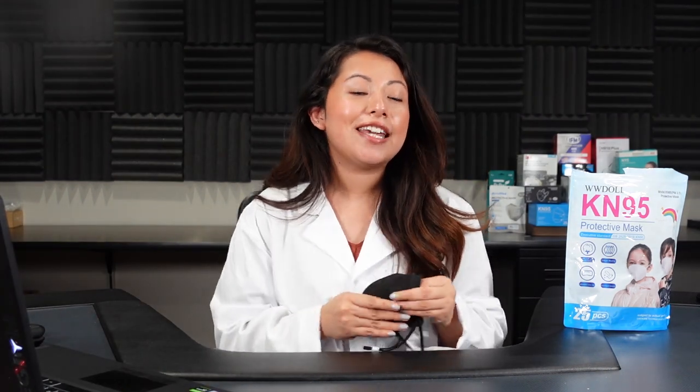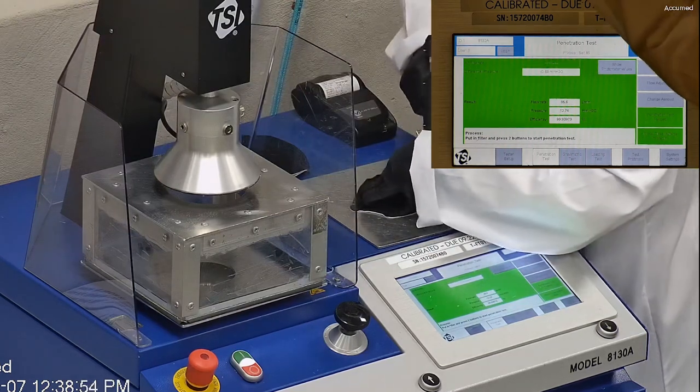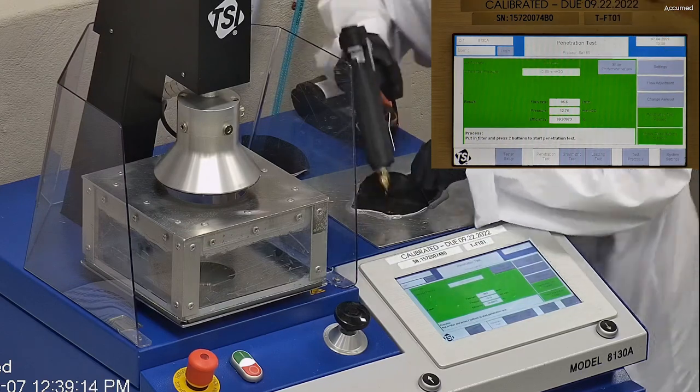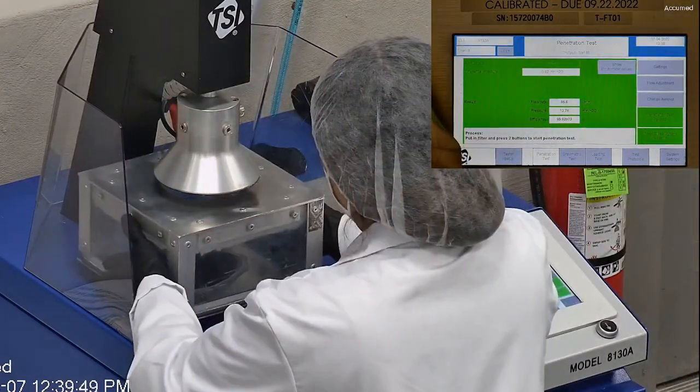But we're going to see how the breathability does on our TSI machine. Let's go ahead and see how they test — we're going to measure filtration along with the pressure drop. This is our TSI machine, model 8130A, which is the same filtration testing machine that NIOSH uses to certify N95 respirators. We first start off by removing the headband from the mask before placing it onto the testing plate to ensure a proper seal.